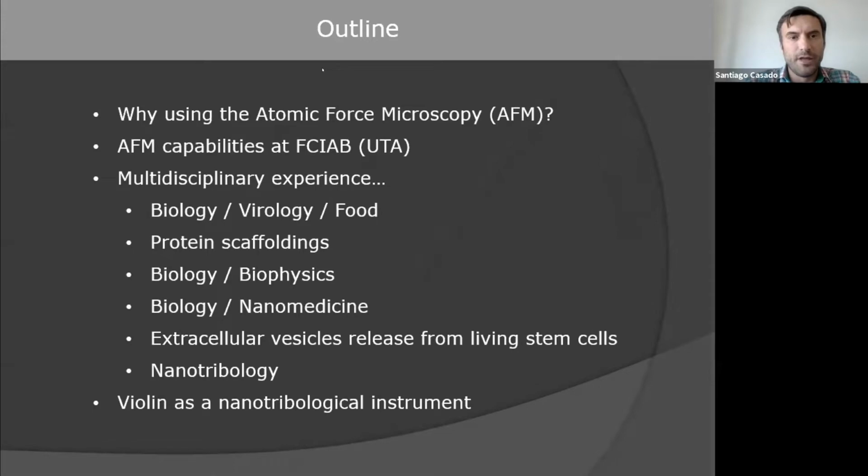This is the outline of the talk. I will start by explaining why it's important to use atomic force microscopy in this particular field of biostructures. I will talk a little bit about the capabilities that we now have at Universidad Técnica de Ambato. Afterwards I will talk about some of the results I have obtained. Of course, it's not a long journey. I have been collaborating with plenty of people from different teams, experts in biology, in food, in protein scaffolding, in biophysics, in nanomedicine. Later I will focus on one particular study related to how to measure the extracellular vesicles released from living cells, so in vivo.